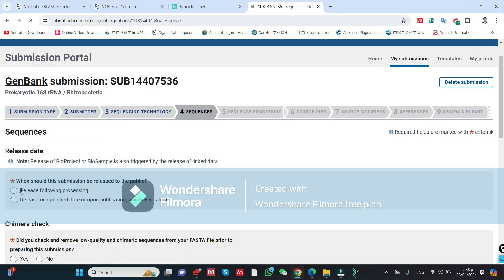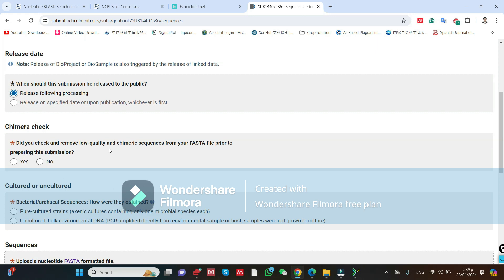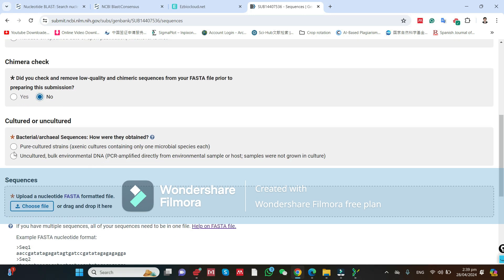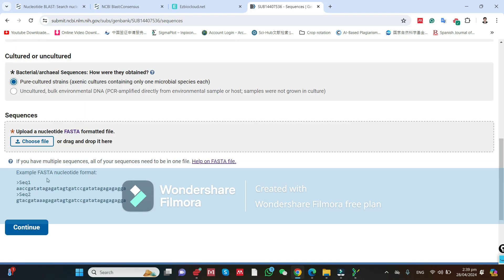Click Continue. It will ask about the release date — after processing, or you can give a specific date. I always follow release following processing. It asks whether you have removed low-quality chimeric 16S rRNA sequences. I have already removed them, but you can click Yes and specify the software used. I will click No. These are pure cultured strains grown in a laboratory as a single species, so I will select that option.